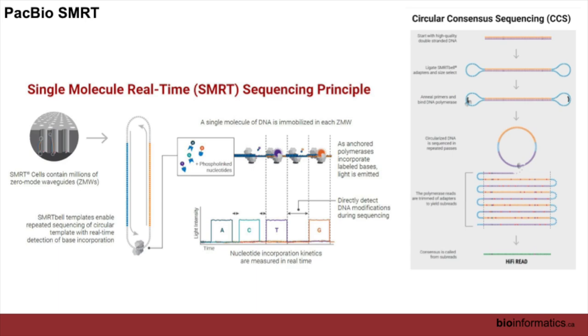And finally, I'll just mention PacBio. This is also sequencing by synthesis, but we're not capturing it on a substrate in the same way. We're looking at wells holding these constructs, and we're measuring signal from the fluorophores as well. It's a real-time base calling that's happening as each base is incorporated. It's a signal that's shown here and instantly converted over to a base call.